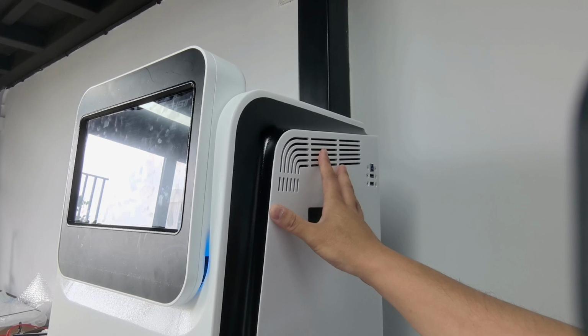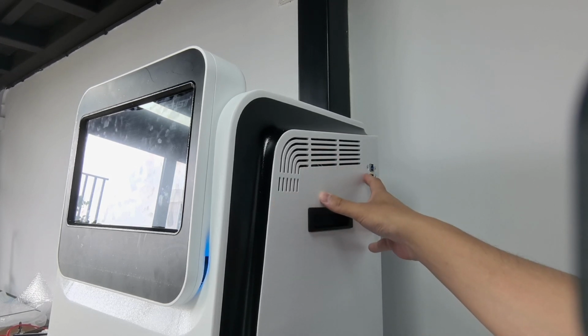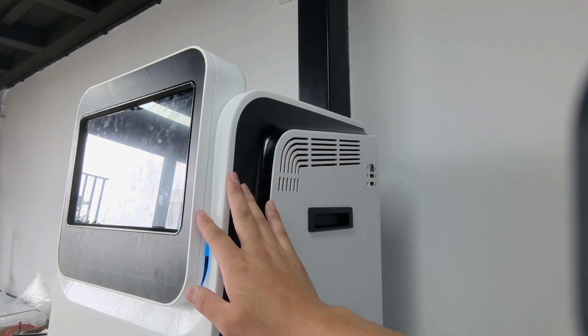And setting the auto saving path to the external SSD will avoid saving to the PC, because the storage space of our PC is limited.